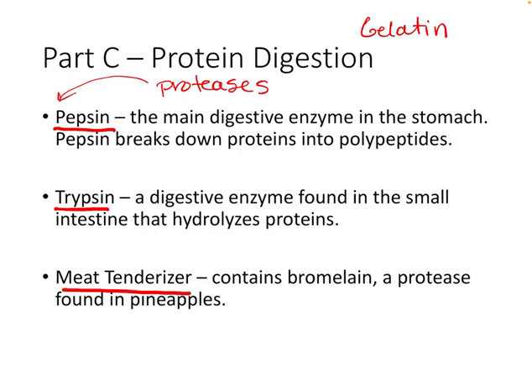So often on gelatin packages, it tells you not to use any pineapple juice, for instance, because the bromelain will actually break down the gelatin and it won't form the jello-like structure that you're looking for. So we'll see how these react under certain conditions.